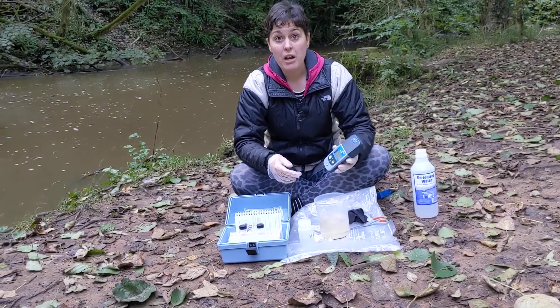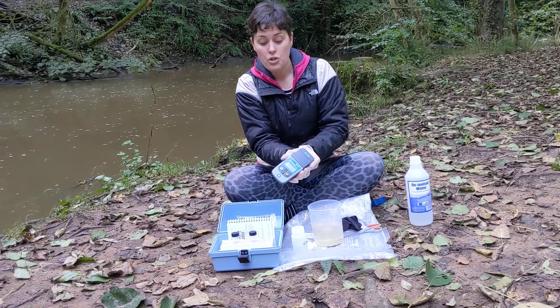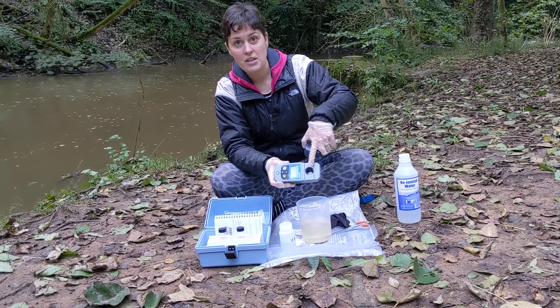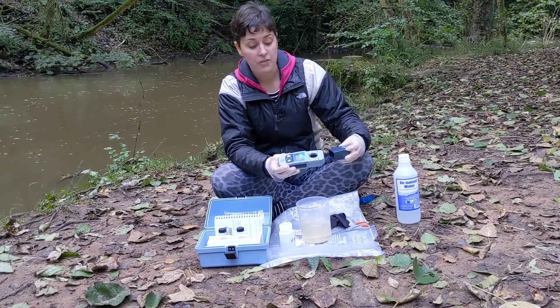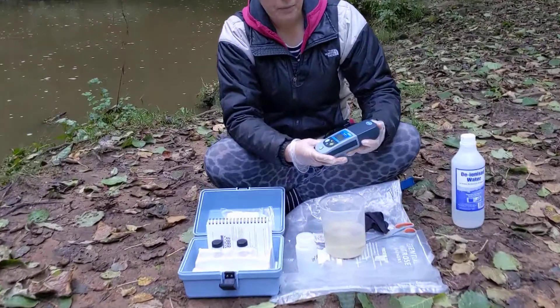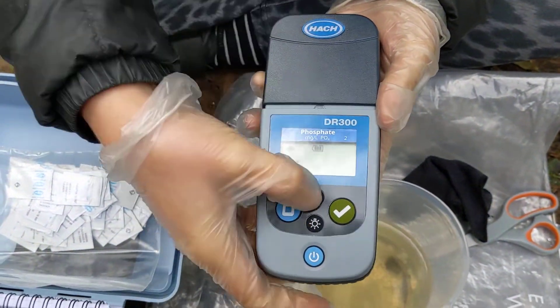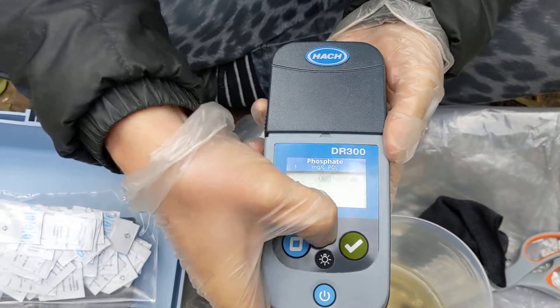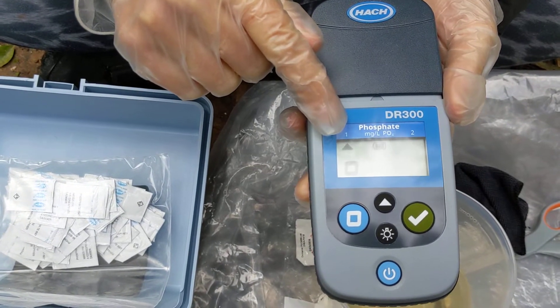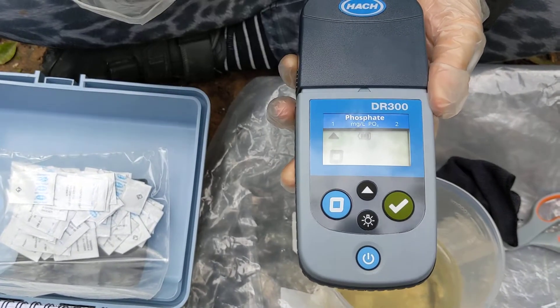The first time you operate your colorimeter you'll need to set the time. After that you should store it. The top section of the colorimeter comes off — here's the cap, and there you can see the hole where you put your cuvette. When you first switch it on, you'll see a triangle pointing to number one or number two. You want to make sure the triangle is pointing to number one because we're using the low range. If it's pointing to number two, just click the triangle button and it will move back to number one.